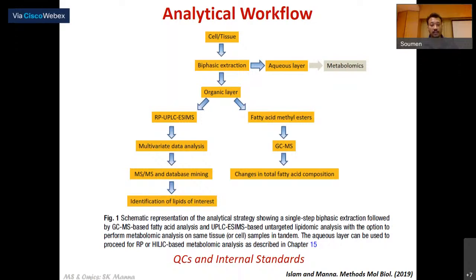You have to dry and spot it and you can use it, but because there is a significant interference from the matrix compounds, MALDI is not really widely used for looking into metabolites particularly, and also in case of lipids. However, for very big lipids, you can have a reasonably good coverage from MALDI. In fact, MALDI-based imaging mass spectrometry analysis mostly throws up lipid species. And that's true for DESI-based and other imaging mass spectrometry as well.